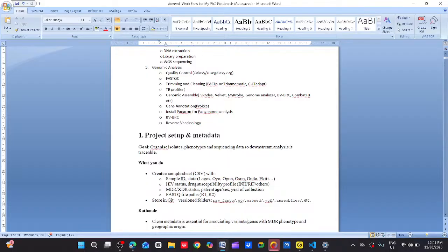When you look at this Panaroo, I made a video, I think last night, where I told us about what a pangenomic analysis is, what it entails, the rationale behind pangenomic analysis, and the difference between genome and pangenome. Genome is talking about the same strain, the same organism, but pangenome is talking about more than one. And I told us that it is going to help us to differentiate further the annotation of our sequence or our protein.